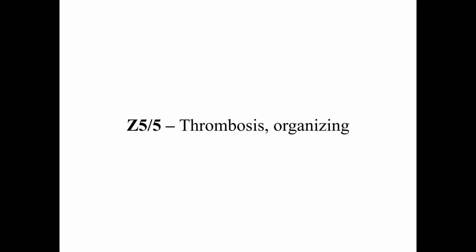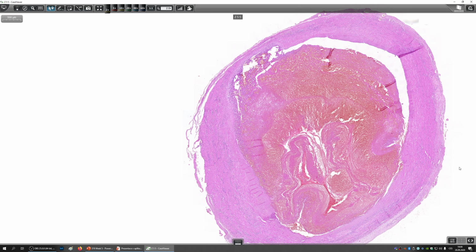So let's check out another fate of the thrombus before we jump. Another type of thrombus is the so-called mixed thrombus. We just show it to you because we think it's nice.